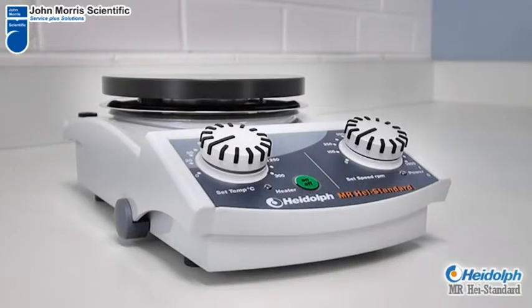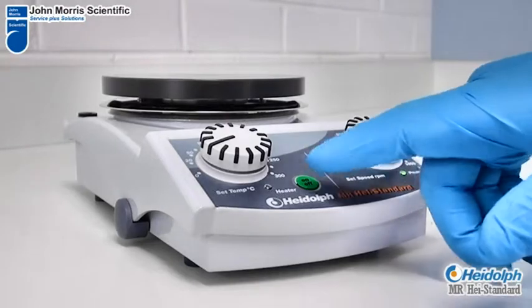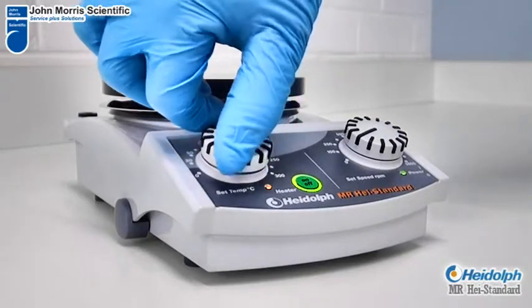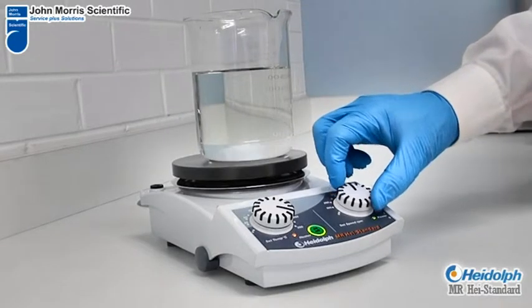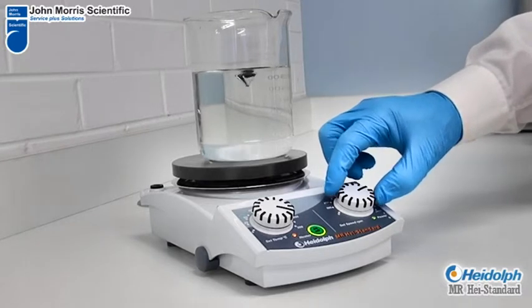The Haidoff MR series hot plate stirrer is ideal for chemistry as well as general laboratories. A separate illuminated on/off switch reminds the user that heating is still taking place. Its Kira disc coating provides immediate heat transfer, giving rapid heat up times as well as excellent chemical resistance.